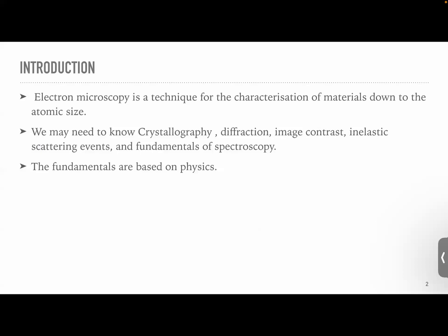But if you are doing SEM or TEM and you want to know about your sample and about the instrument also, you should have some prerequisite knowledge about crystallography, how diffraction of the electron beam happens, and image contrast, what gives you the different contrast in your sample. That means elastic scattering and inelastic scattering events, basic physics. You should know the fundamentals of spectroscopy. Whatever is happening inside the instrument and during the interaction with your sample, everything is based on the laws of physics. Nothing is beyond that.